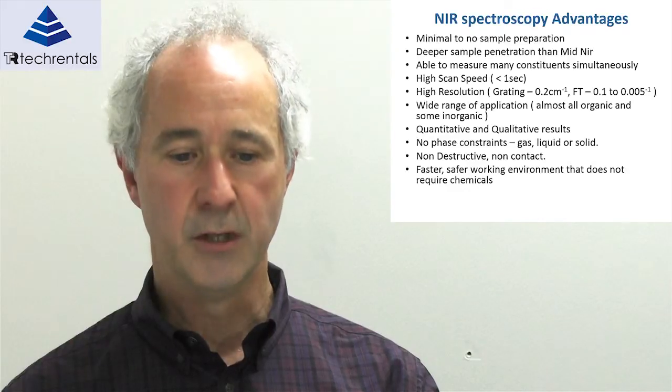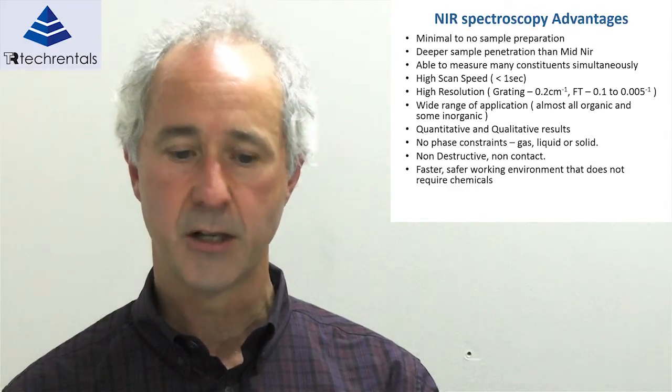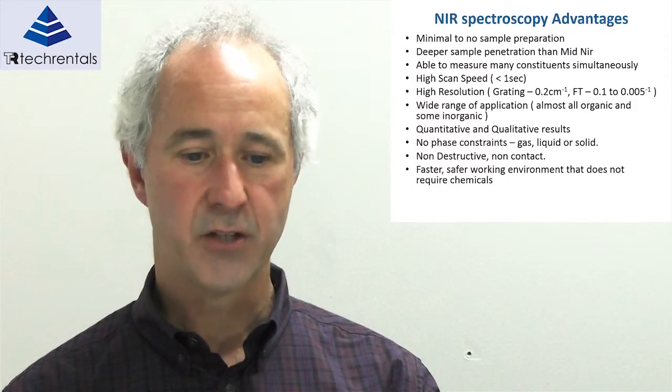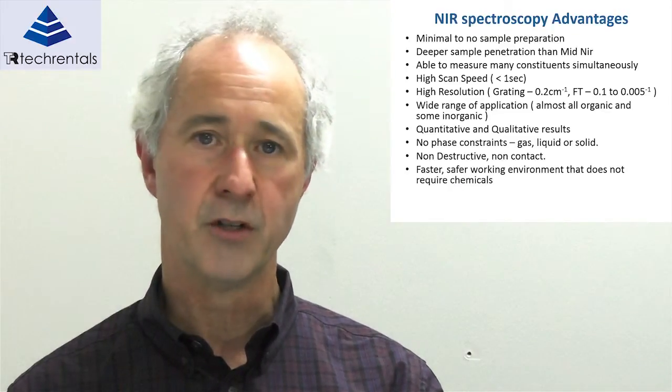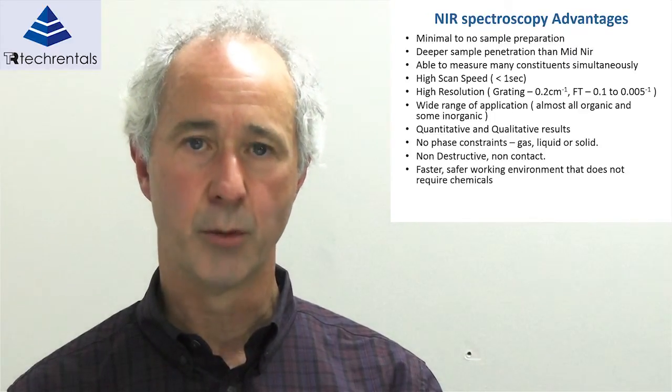So the inline use can be monitoring your process or your material 24 hours a day, 7 days a week. And it's faster and safer because it doesn't require any chemicals. Often with mid-infrared spectroscopy, you need extra chemicals to mix with the sample or product before it can be measured on the instrument.